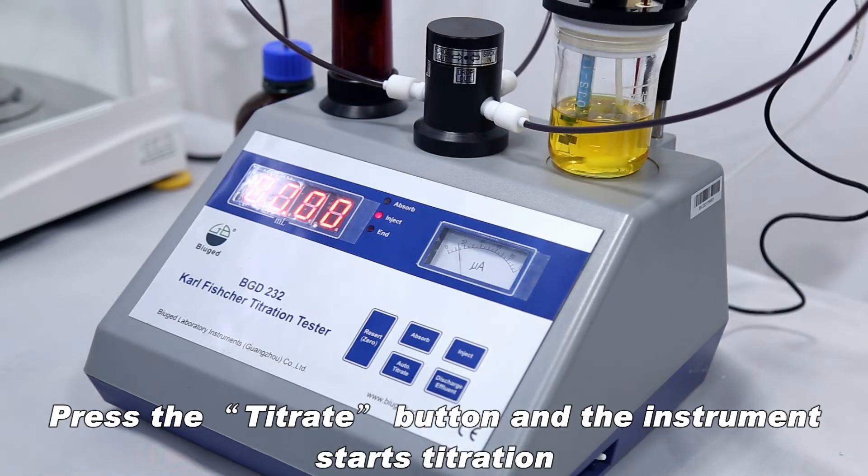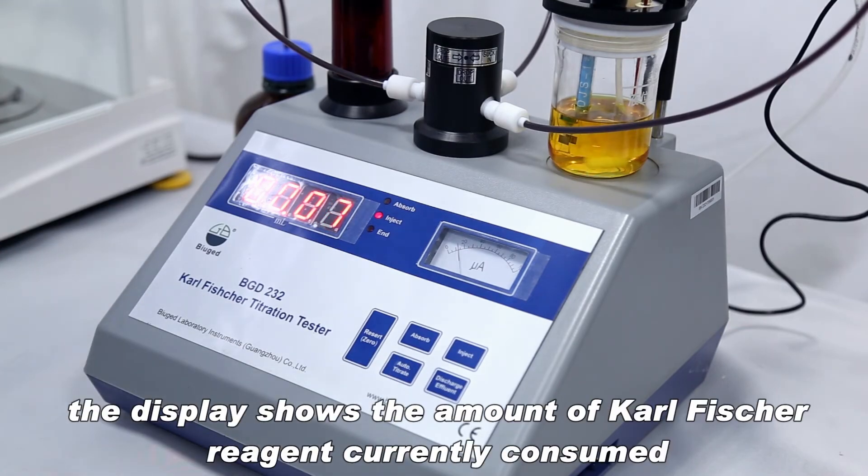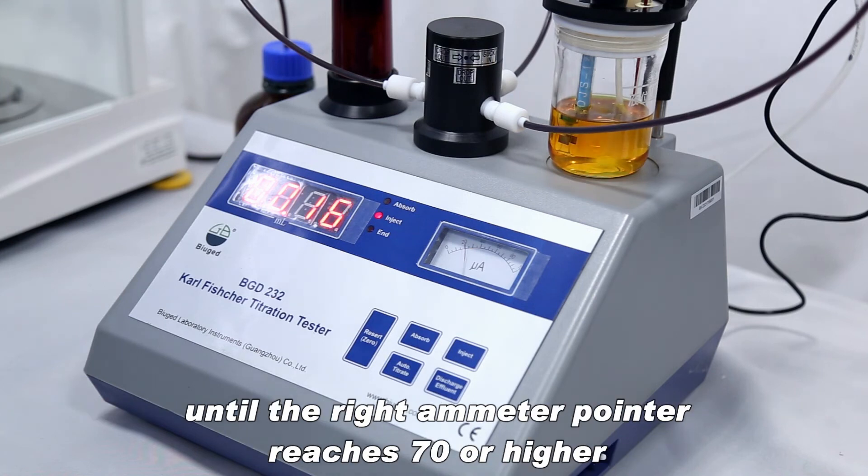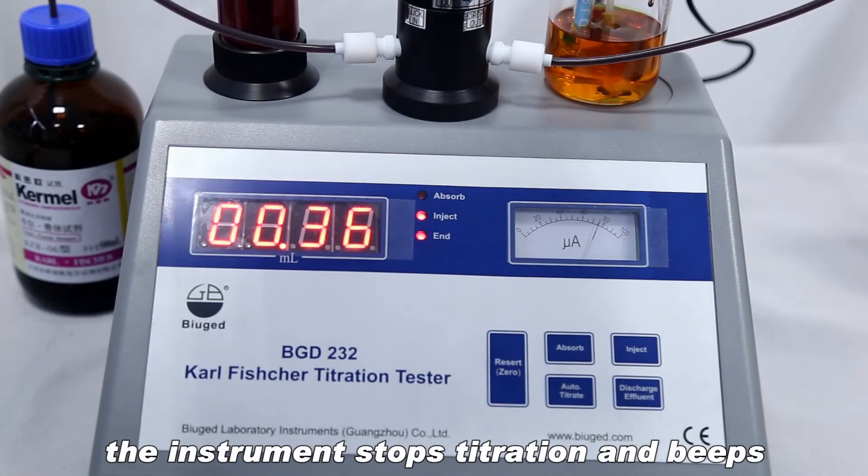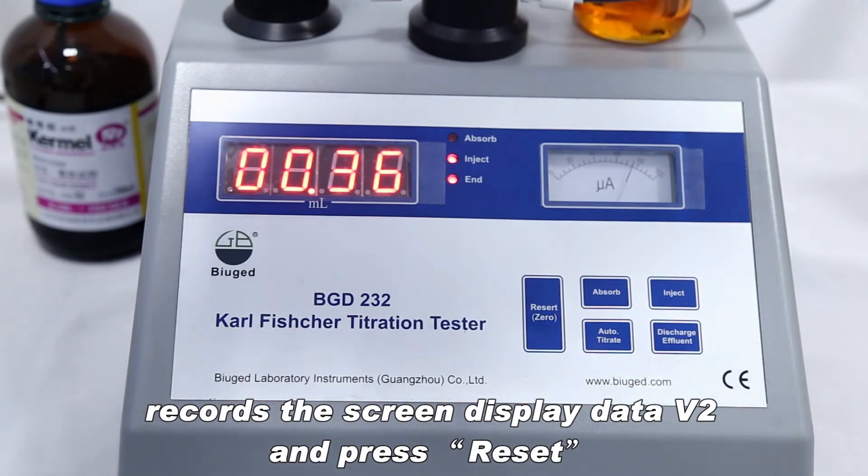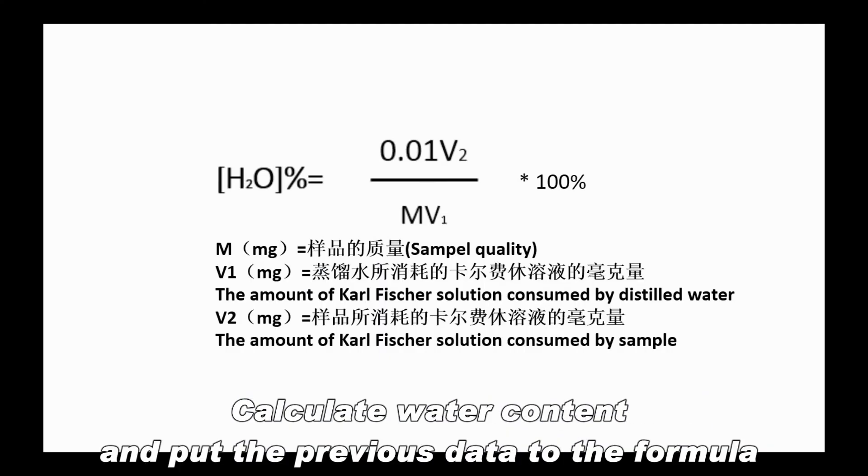Press the titrate button and the instrument starts titration. The display shows the amount of Karl Fischer reagent currently consumed. Until the right ammeter pointer reaches 70 or higher, the instrument stops titration and beeps. Record the screen display data V2 and press reset. Calculate water content and put the previous data to the formula.